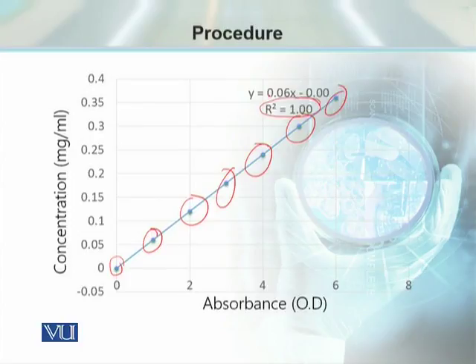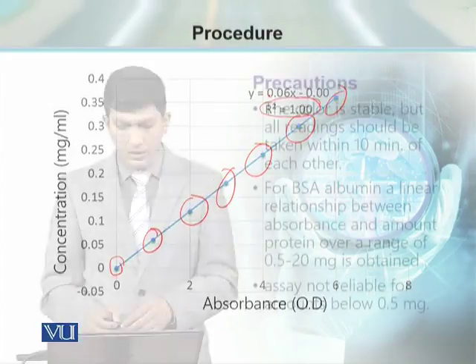जो conventional या simple spectrophotometer हैं, when we go to those, we have to have this standard curve, and then we can take the optical densities from there, and then we can read the concentration from this particular standard curve.